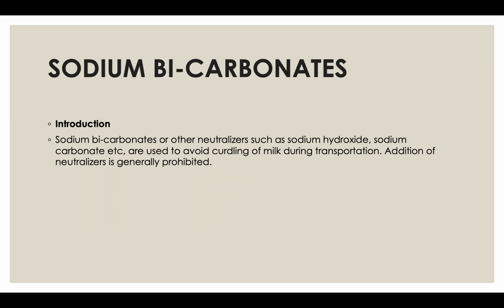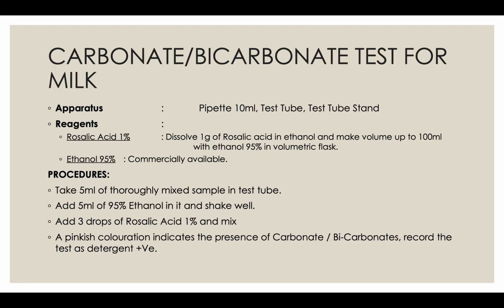Sodium bicarbonate or carbonate test. Sodium bicarbonate or other neutralizers such as sodium hydroxide, sodium carbonate, etc. are normally used to avoid the curdling of the milk during transportation. Addition of neutralizers is generally prohibited. For this test, we need a 10 ml pipette, test tube, and test tube stand. Chemical reagents required are rosolic acid 1% solution and ethanol 95% solution.